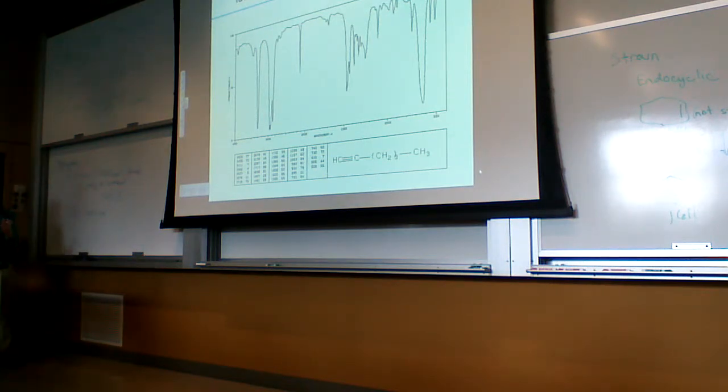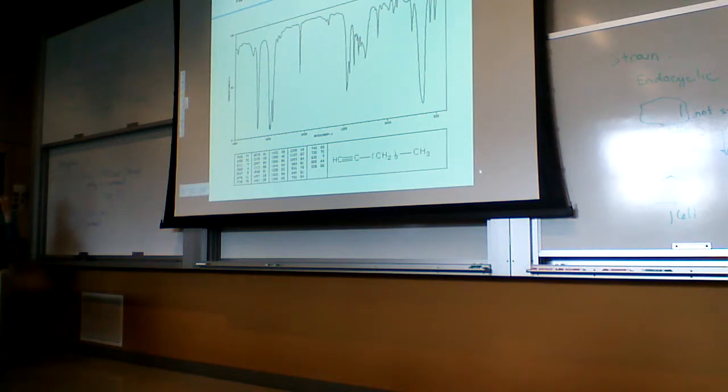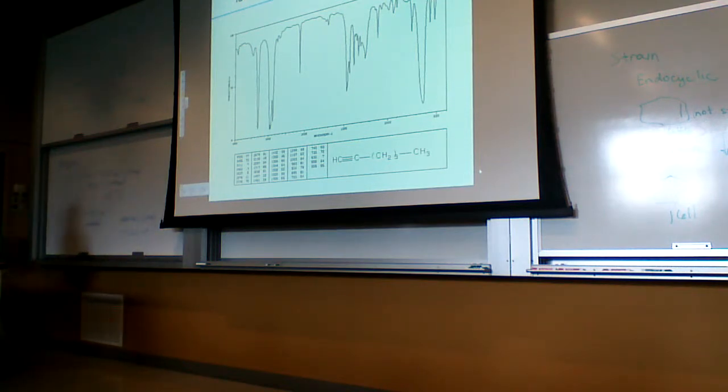And again, typically we're going to see these in terminal alkynes because the dipole moment is going to be different between the two carbons. If you have an internal alkyne, their intensity is pretty weak. So if you have two carbons in there, these are going to be weak signals because they don't have a strong change in dipole moment and they don't absorb the light very well.